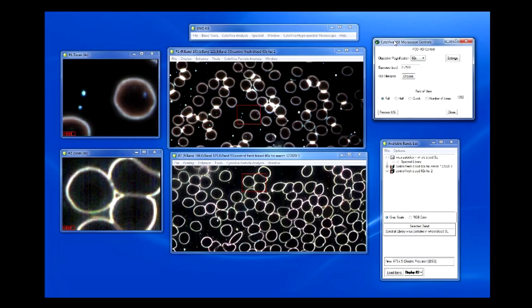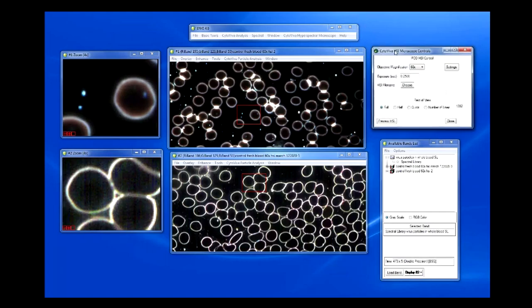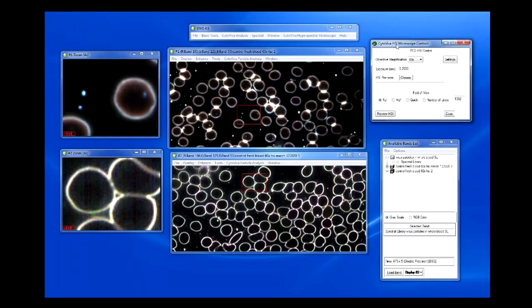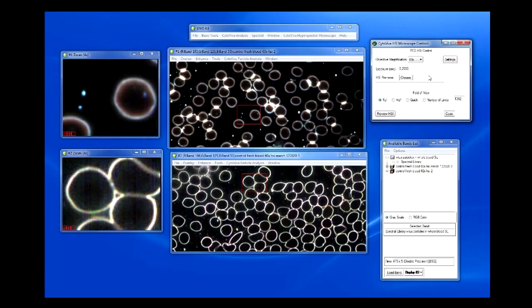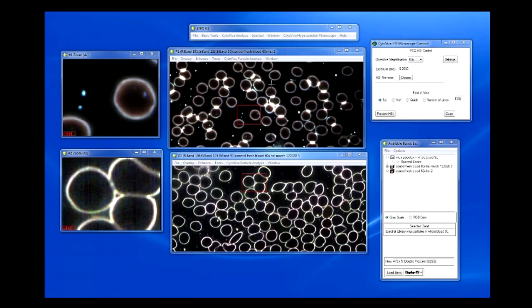In some webinars we've captured a hyperspectral image live on the microscope, but we're not going to do that today in the interest of time. What we do want to demonstrate is how you actually capture a hyperspectral image. What I'm moving around on screen right now is the actual GUI for the hyperspectral microscope controls. To capture a hyperspectral image, you first choose the proper microscope magnification, set the exposure, create a file name, and decide how large the image should be in terms of lines from the center of the field of view.